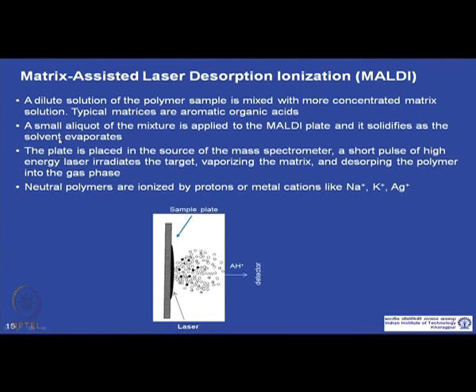A small aliquot from this mixture is taken and applied to the MALDI plate, and it solidifies as the solvent evaporates. The plate is placed in the source of the mass spectrometer.